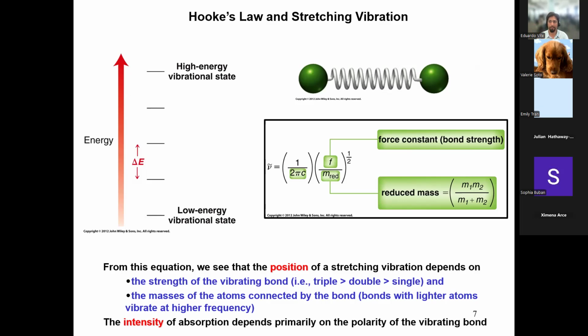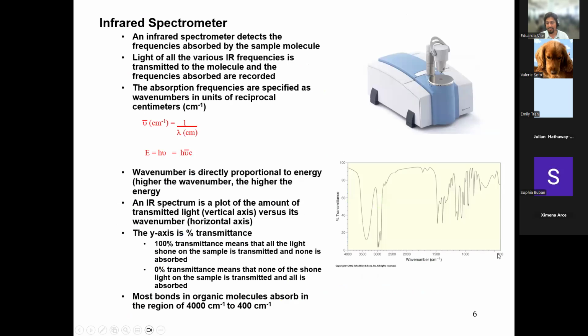So any questions? So the x-axis that you saw on this chart earlier, let me go back real quick. The x-axis, the wave number, has to do with bond strength. So you can write that down in a sentence. The x-axis tells you the bond strength. So what does the y-axis tell you? The y-axis tells you the bond polarity change. The more the polarity, the dipole changes in the bond, the stronger the signal is going to be.